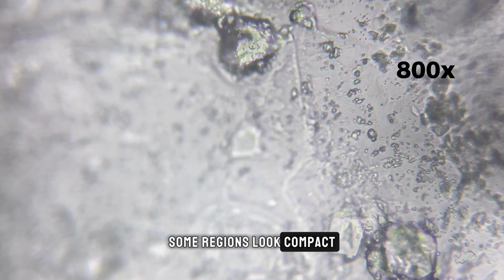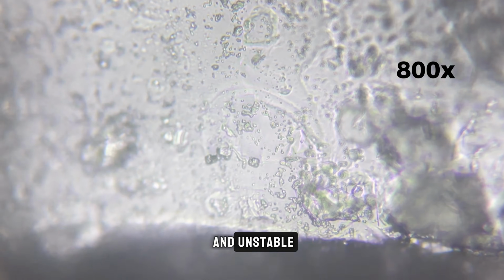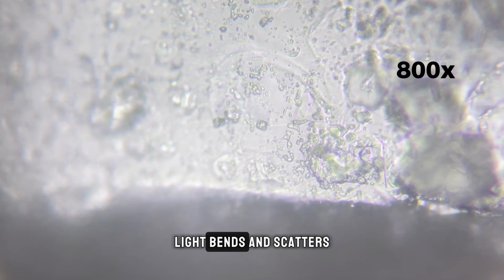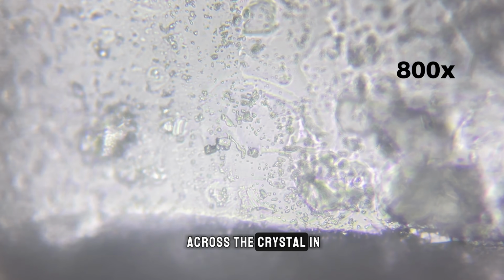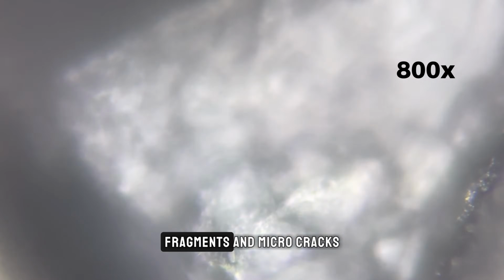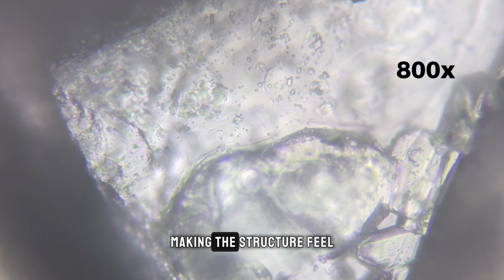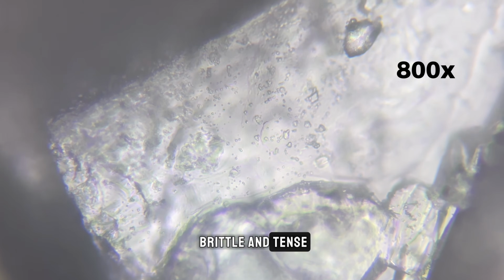Some regions look compact and tightly bonded, while others appear porous and unstable. Light bends and scatters across the crystal in unpredictable ways, creating bright highlights and deep shadows. Fragments and micro cracks are everywhere, making the structure feel brittle and tense.